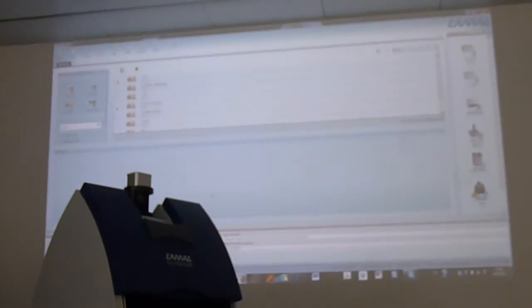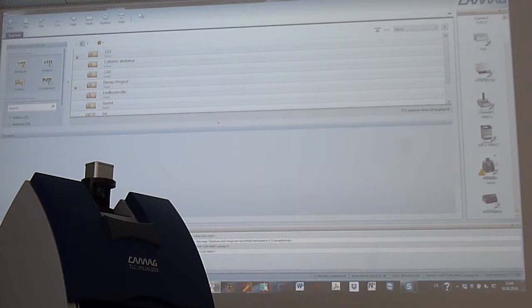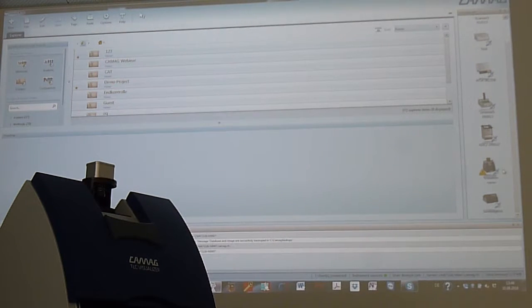So, okay, here we have Vision Cats, and now we already see the first problem down here. Easy connection. There is a visualizer, but this little block, which is not blocked, is a sign that it is not correctly connected. So this is very good. We already have a first impression of what problem we could have, because this is the usual problem with the visualizer. You don't connect to the software somehow.